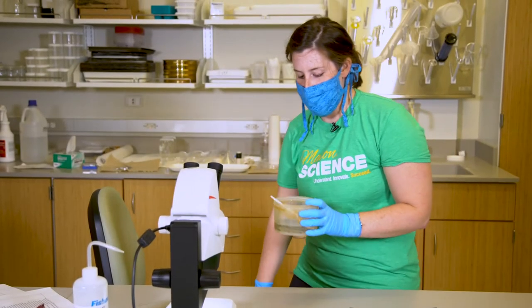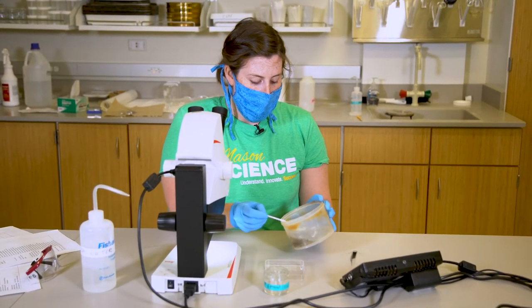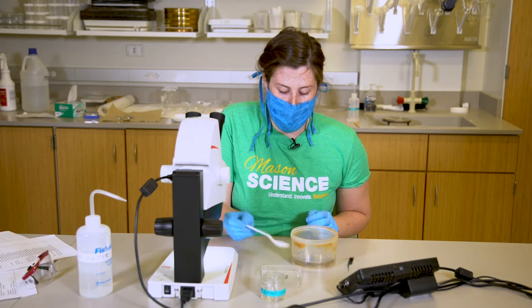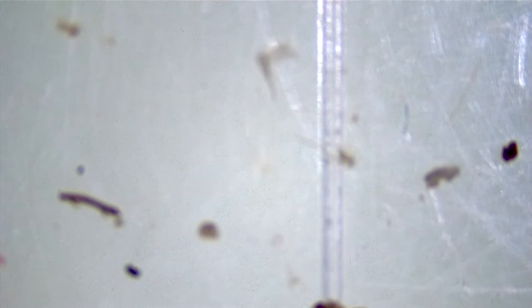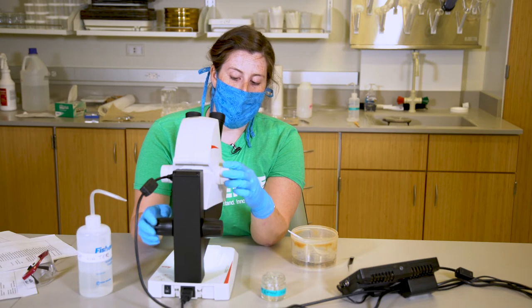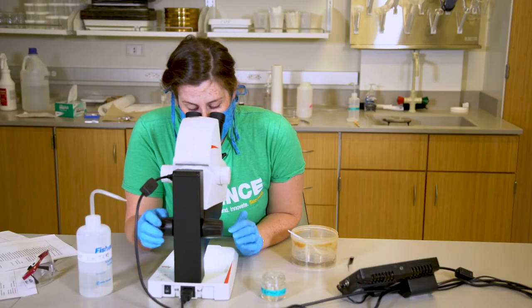Now that we have our sample, we are going to look at it under the microscope. The first thing we're going to do is take a small scoop of our sample and put it into this plastic tray. Once we do that, we move it onto the scope and we want to make sure that we're able to see very clearly through the lens. To do that we use these two knobs — one will be a coarse focus and the other one will be a finer focus. You're going to look through the lens and just turn the knobs until you're able to see the image of your sample clearly.